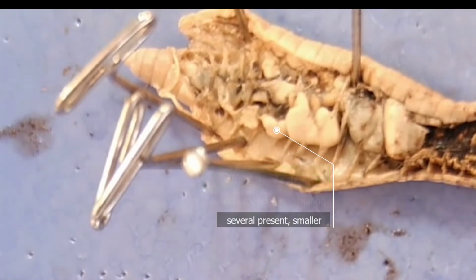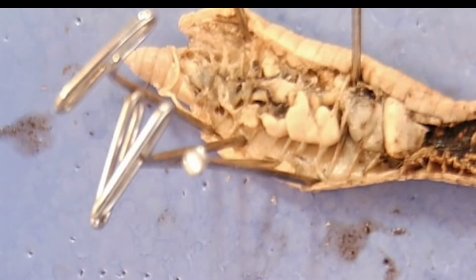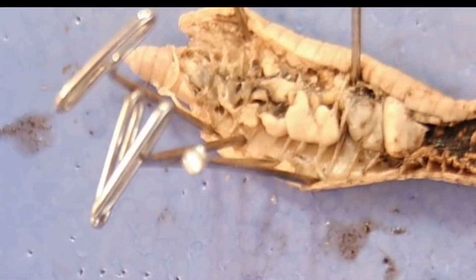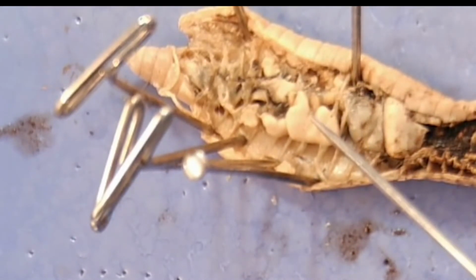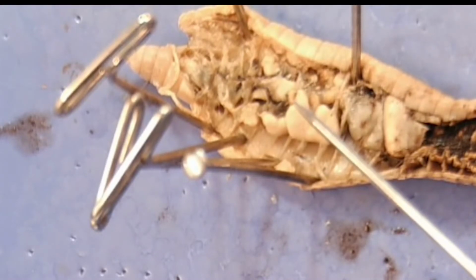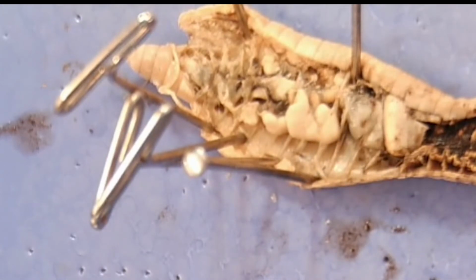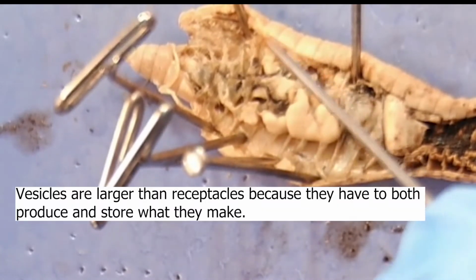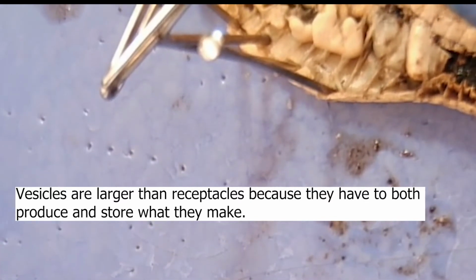Okay. So when the two earthworms attach together at the clitellum, that external structure, and stick together via mucus, each one of them is producing sperm in its seminal vesicle, and each one of them then receives sperm from the other one via the seminal receptacle. The vesicles are quite a bit larger than the receptacles. Which makes sense. Now in this, it's got to create the sperm in the vesicle, right?